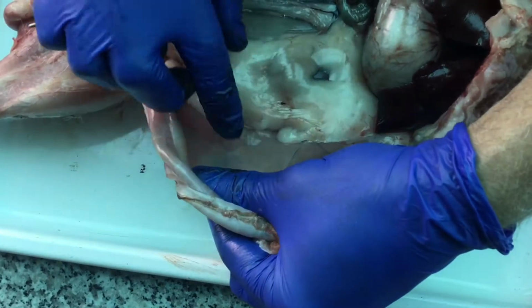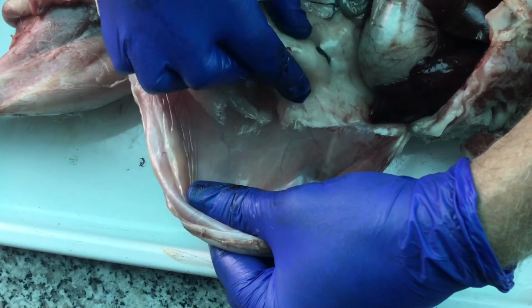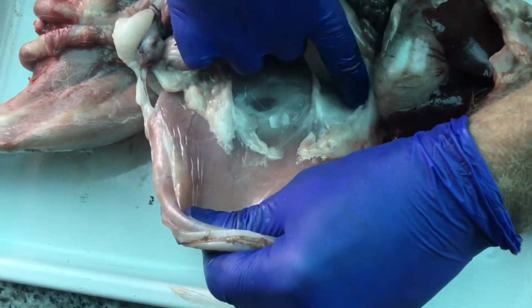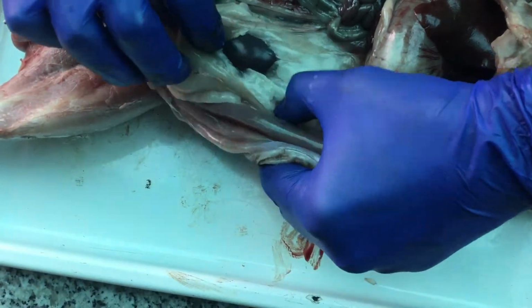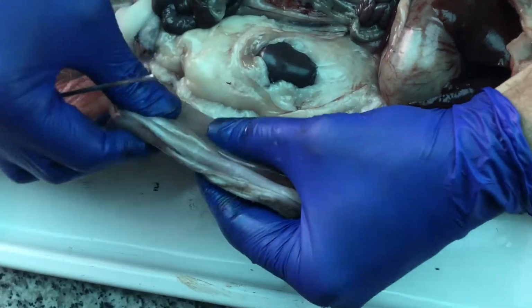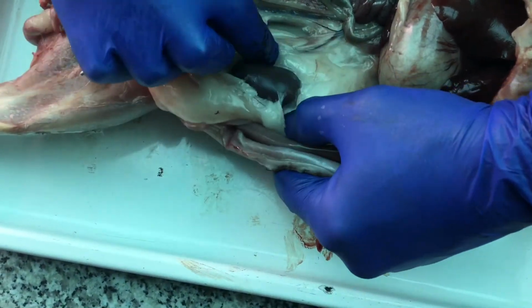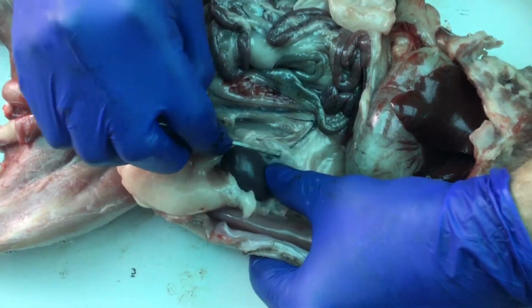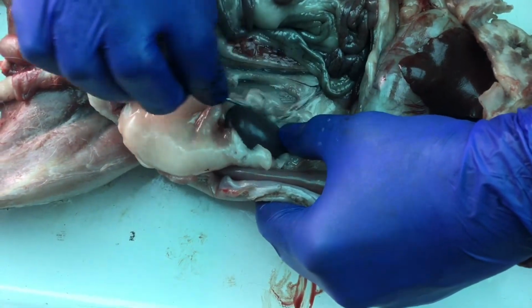Here's all of that saran wrap-like parietal peritoneum with all of this fat overlaying it, that's actually on the outer part of the body. The kidney is almost embedded in the fat in this case. There we go. So you can see it's against the back body wall. If I peel away the fat, there's a nice view of the kidney on the left side, and you can even see the blood vessels coming into the kidney there.